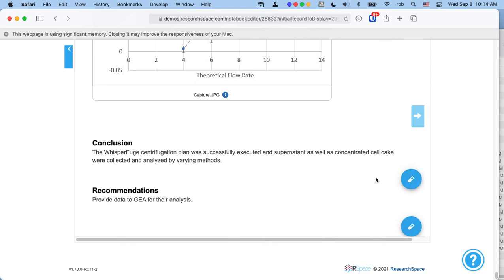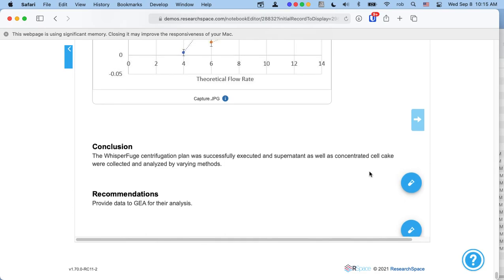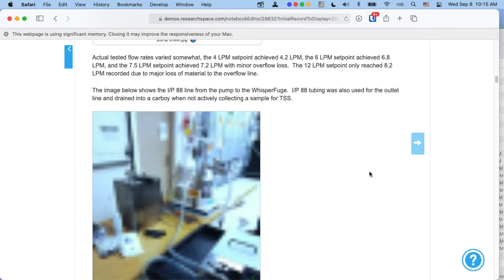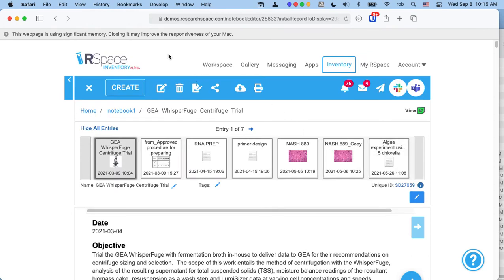So therefore, I can set up my experiments so that I have text fields in specific places to let me create new lists of materials to represent samples that I'll be introducing into the experiment at that particular point in the experiment. So you can have multiple lists of materials, and they can be scattered through the experiment associated with specific text fields as you work.